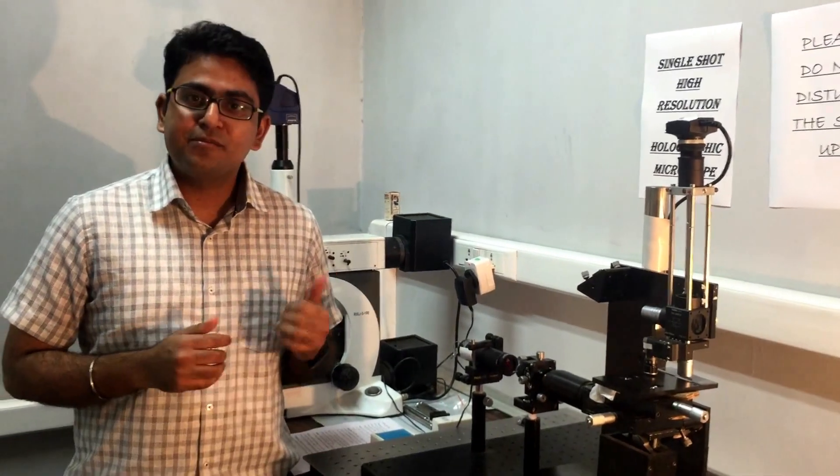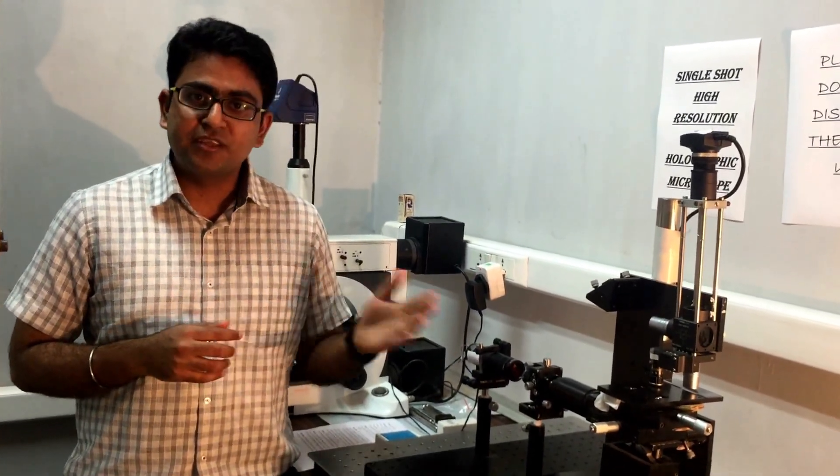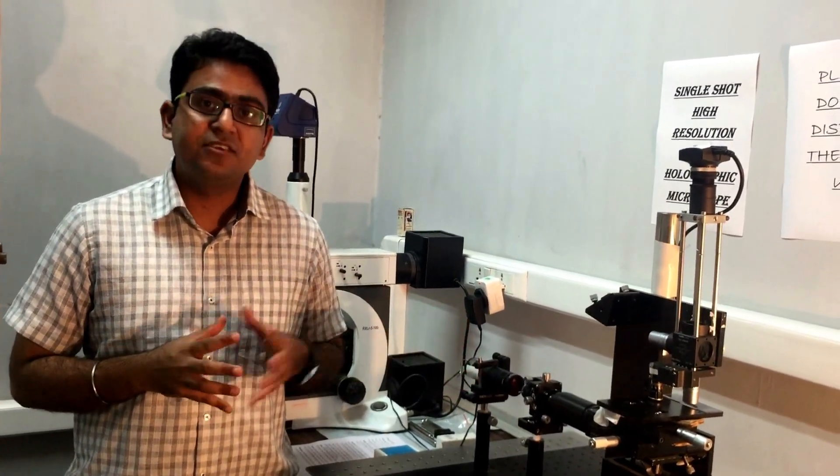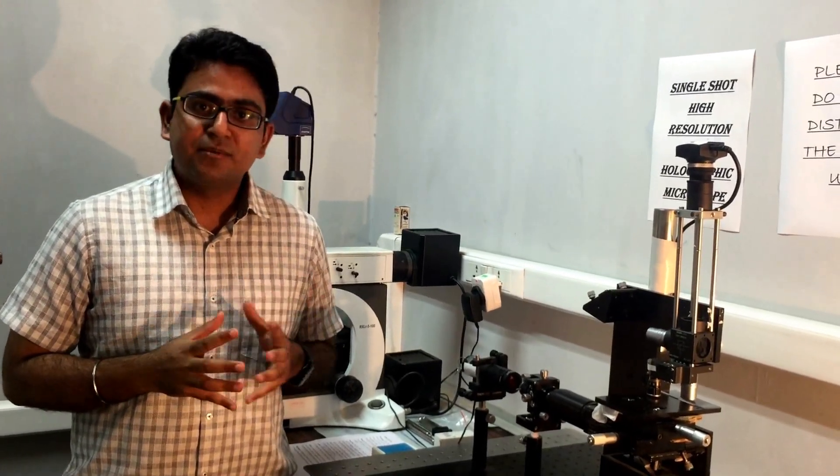Once the slide is ready, imaging is done in a single shot using this 3D microscope, the digital holography microscope system, the DHM.